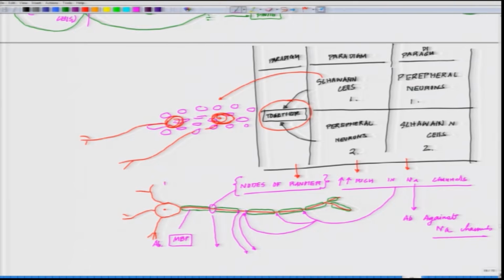you have to have electrical recording from these neurons, and you have to measure the conduction velocity, and you have to compare the conduction velocity of these neurons with a neuron without myelination.